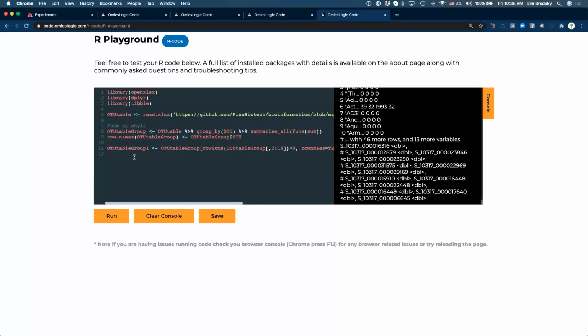All right. And let's also store the phylum just like we did before. So phylum, and we had our factor. Row names is misspelled. Yep, row names. Thank you. Okay, phylum. We will take the factors from OTU table 1, OTU, as we did before.